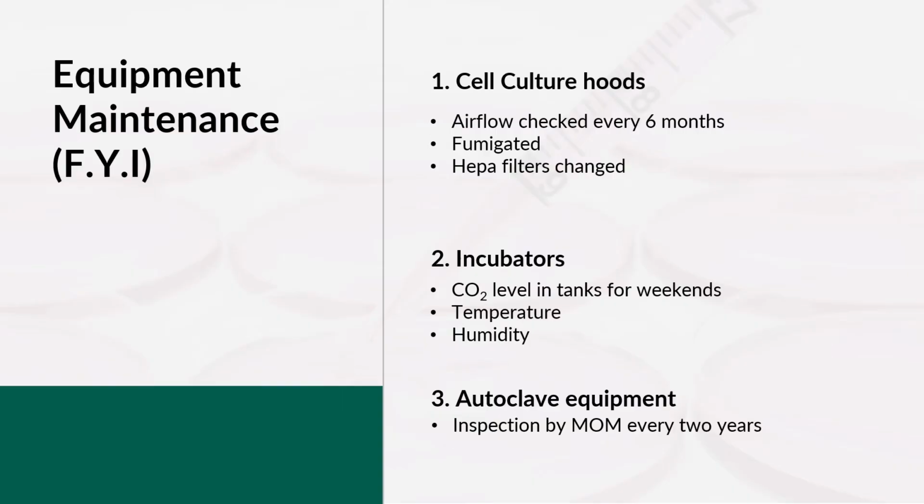However, you do have to do general routine cleaning and maintenance for most of the other equipment in the lab, such as the centrifuge and water bath. Okay?